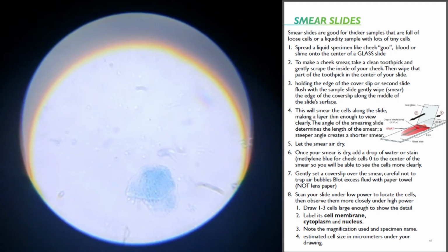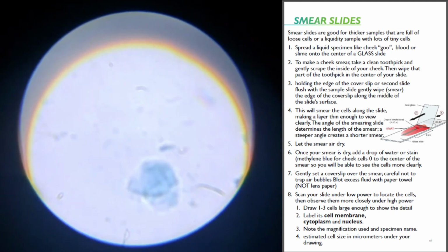All those little tiny specks, I'm not seeing them super clearly, but I'm expecting that to be bacteria. There's a little something moving up there.